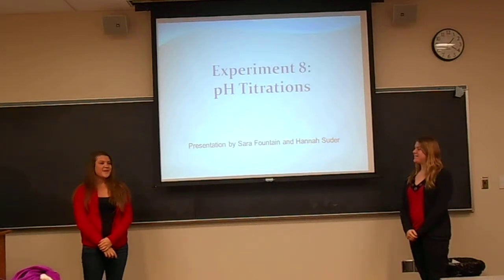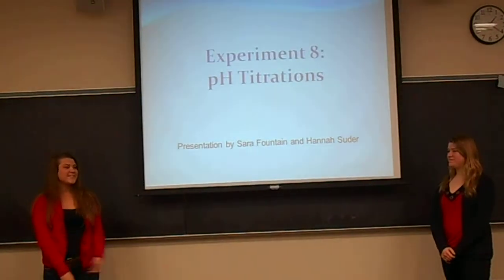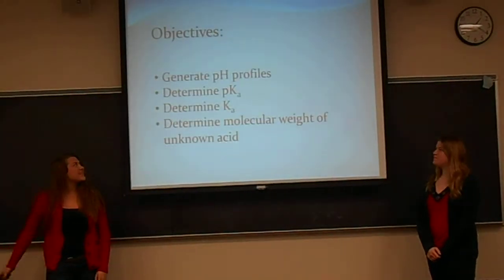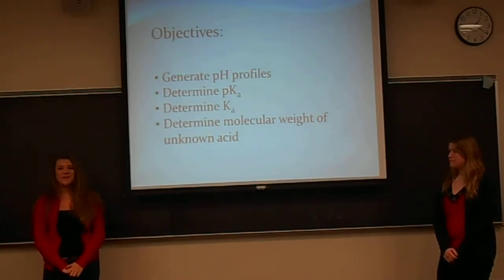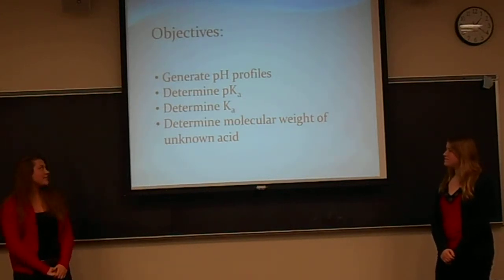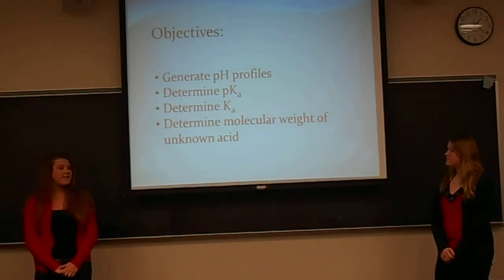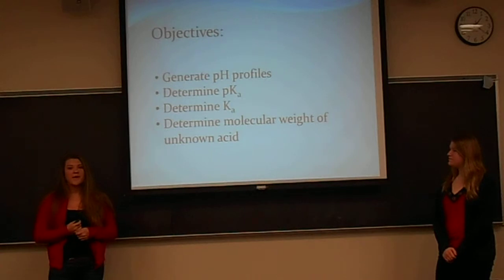This is our presentation on Experiment 8 involving pH titrations. My name is Hannah Suter and this is my partner Sarah Fountain. Our objectives of this experiment were to generate pH profiles using result tables and graphs. We determined the pKa using the tables and the graphs, and we determined the Ka from calculations using that. We also determined the molecular weight of the unknown acid.